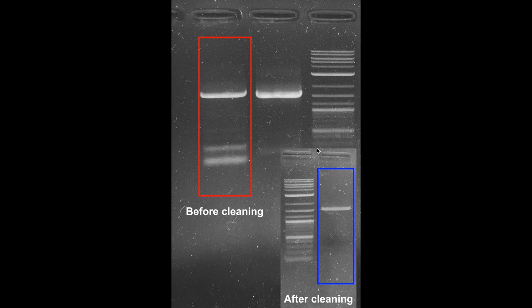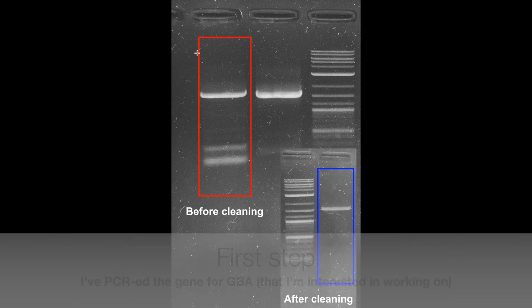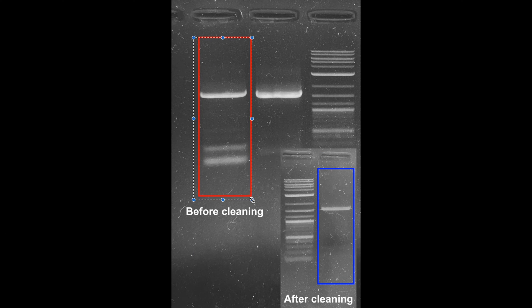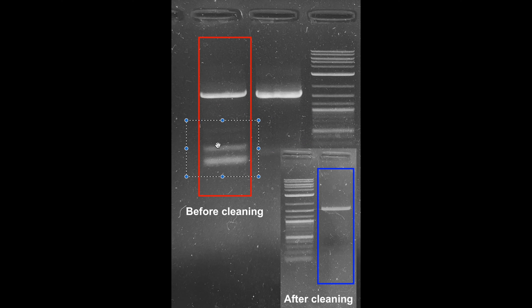As you can see in this gel right here — I have two gels actually, one is before cleaning and one is after cleaning. I basically PCR'd the GBA gene that I plan to use for cloning in one of my plasmids. However, besides the correct amplicon right here, I do have four tiny fragments which are basically non-specific amplification. Before cloning I need to get rid of these fragments, otherwise they will get cloned instead of the correct one and I will have many problems downstream.